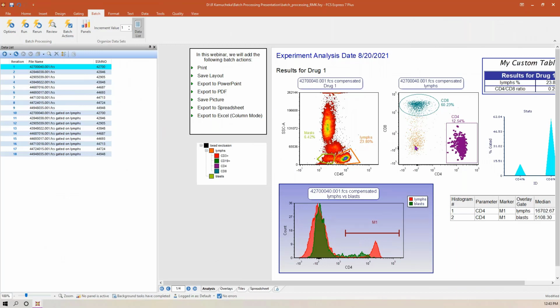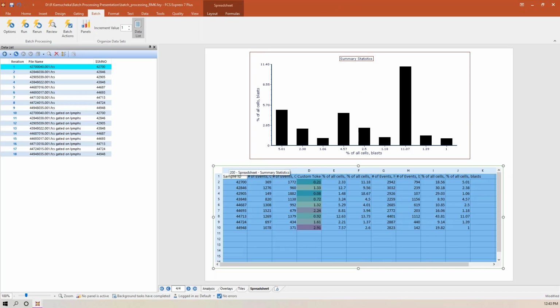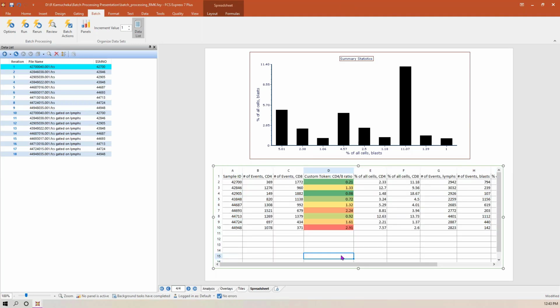And so the last thing that was created for us is this internal spreadsheet. So I had done some work behind the scenes here, and when I set up this spreadsheet, I already had added some conditional formatting. So when I inserted this information, it already did that for me. I didn't have to go back and create this. It was going to store any of the changes or any of the formatting that I did to the spreadsheet. Additionally, it's going to use the defaults here to introduce these axes labels.